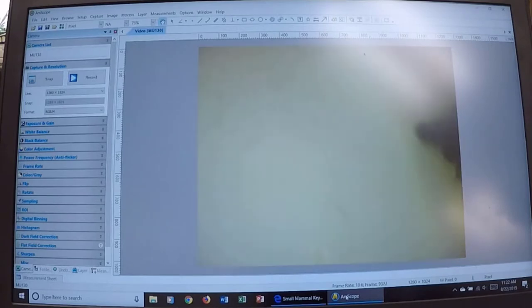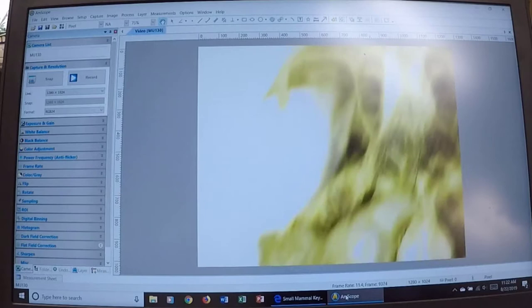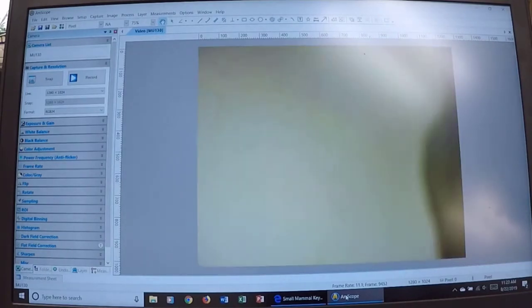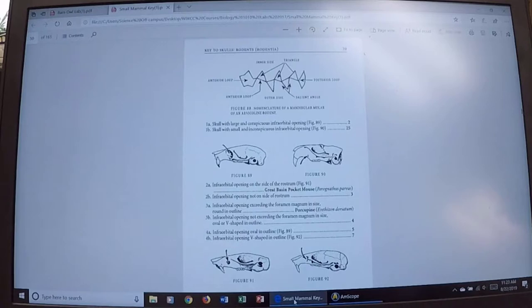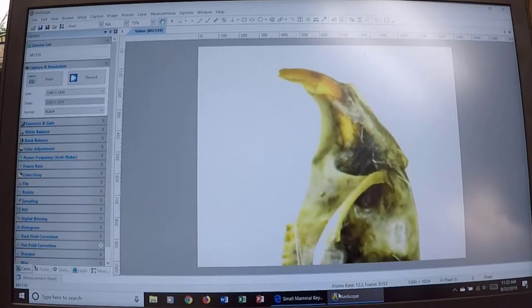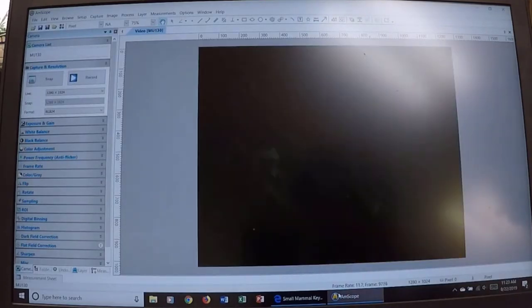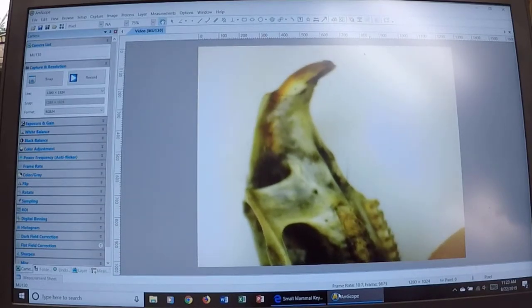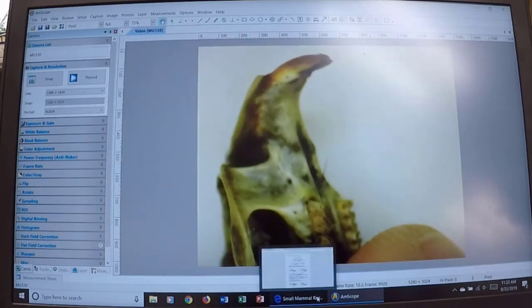Step two: is the infraorbital opening on the side of the rostrum? If so, it's a great basin pocket mouse. I happen to have a great basin pocket mouse skull. You can see this infraorbital opening is not up against the zygomatic arch — it's on the side of the rostrum and it's large. Even without teeth, just those two features identify it. However, the skull we're trying to identify has a large infraorbital opening up against the zygomatic arch, so we continue to step three.